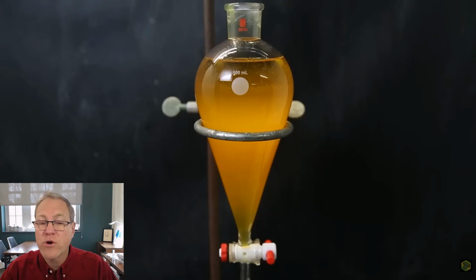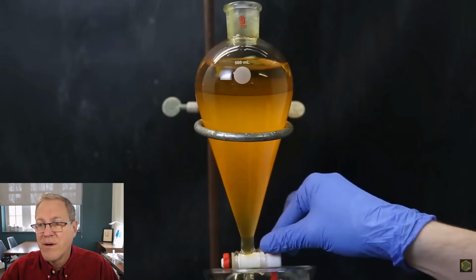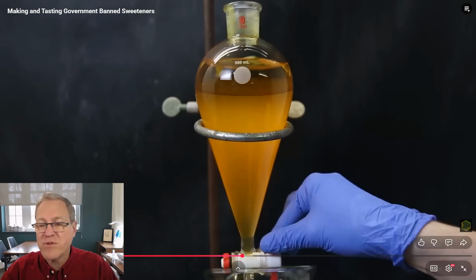And remember, his product's orange, and he is seeing that top layer. Separate them. There's some orange there, but notice on the bottom layer, there's some orange there too. That could be product. So we're going to have to see how he deals with this, but he's going to drain this out at the bottom through the stopcock.